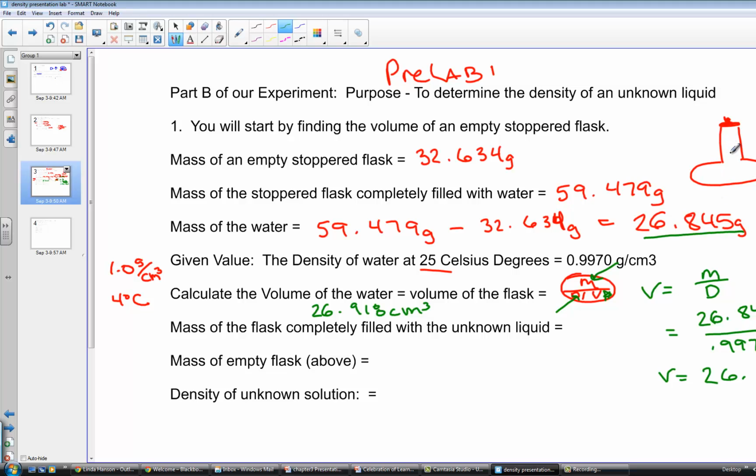We determined the mass of the water experimentally by weighing an empty flask, filling it with water, and weighing it again. The difference must be the added weight, which is the water. Knowing the density of water provided for us, we take the mass over density to pull out V, the volume of the flask.